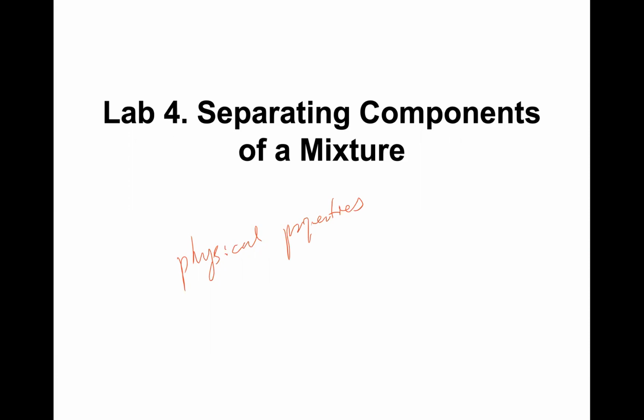the basic introduction about those separation tools or methods, you will design a unique way or sequence to separate the mixture of different components. Let's say, what kind of method can we apply to separate the molecules? So what kind of property can we apply to separate them?